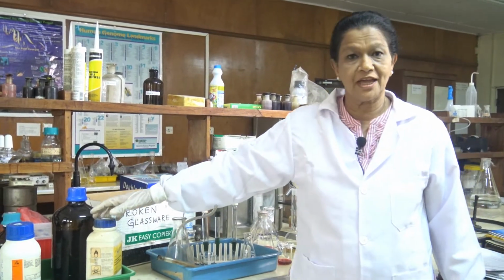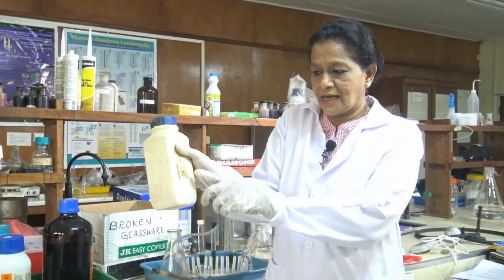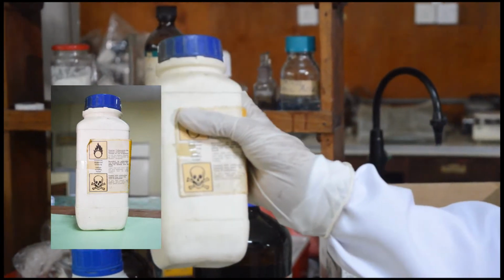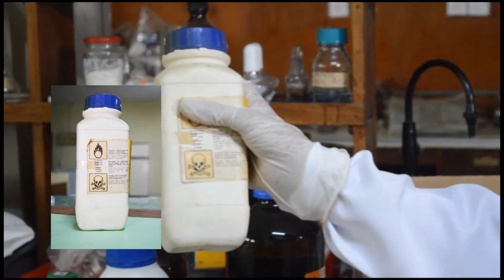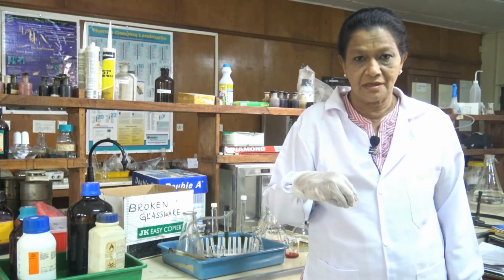First, I will explain the hazardous nature of chemicals. This sign indicates the hazardous nature of this particular chemical. This is a toxic chemical. This can enter into the body by ingestion.